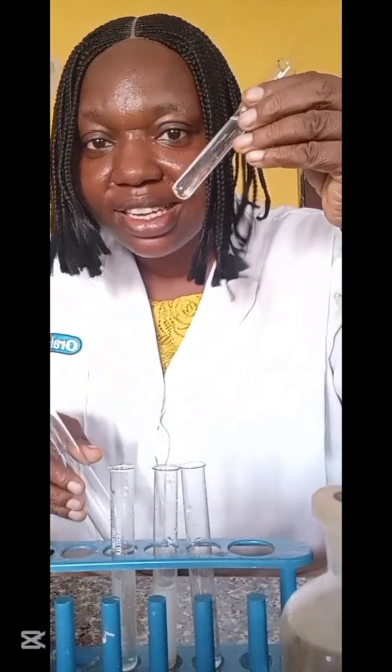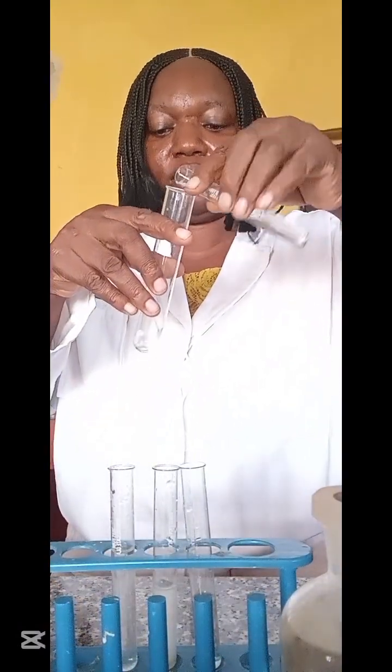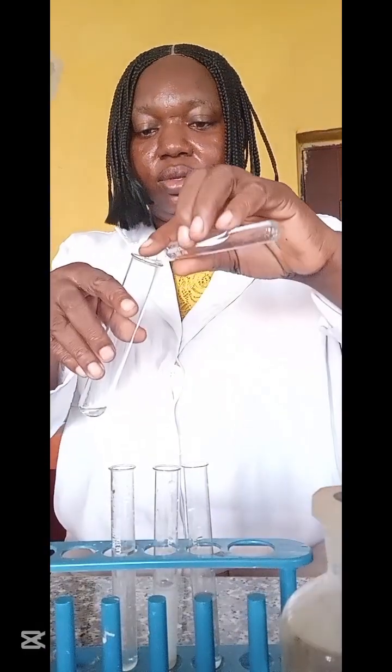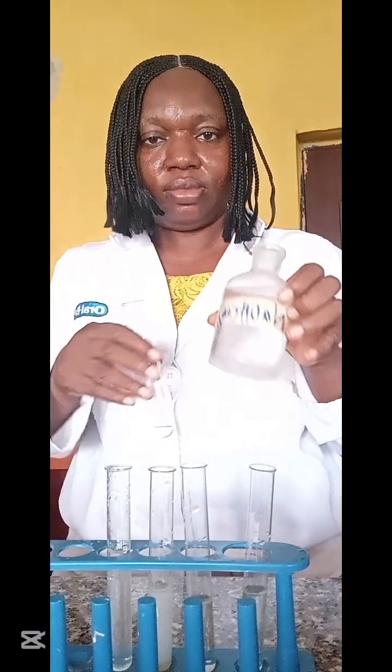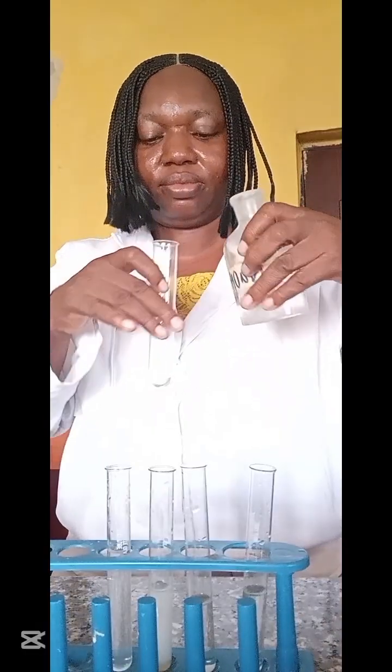So the first one, this sodium hydroxide. See what I'm saying? This is a white gelatinous precipitate. A white gelatin. You can see how it is, white, sticky. So this is either Zn2+ or Al3+.